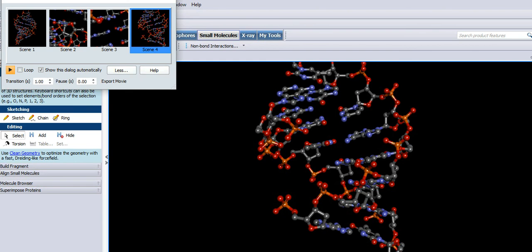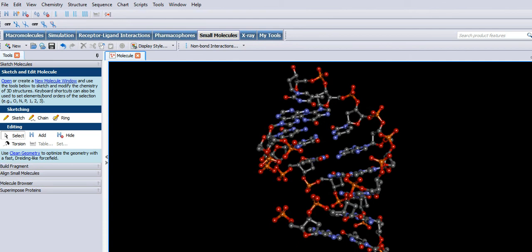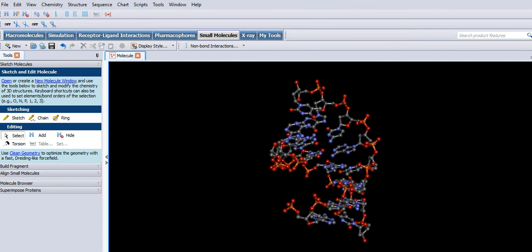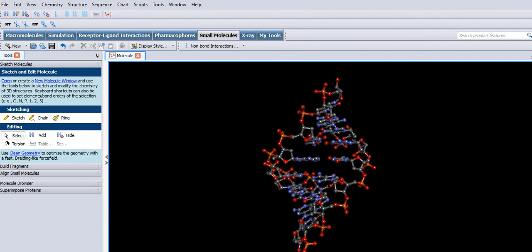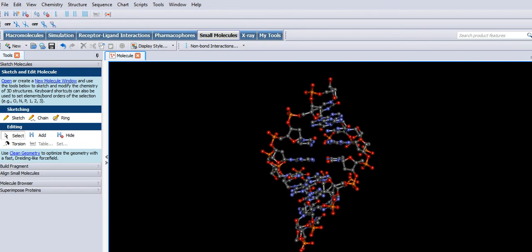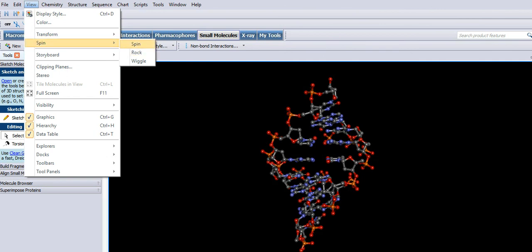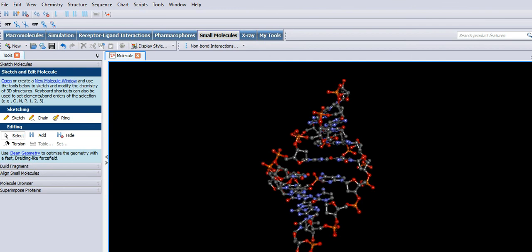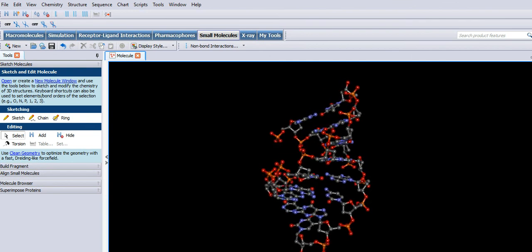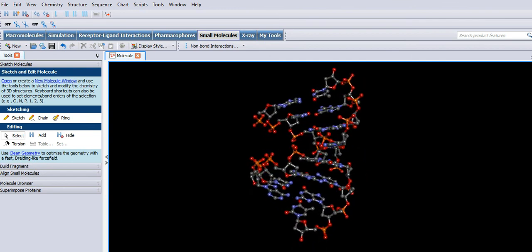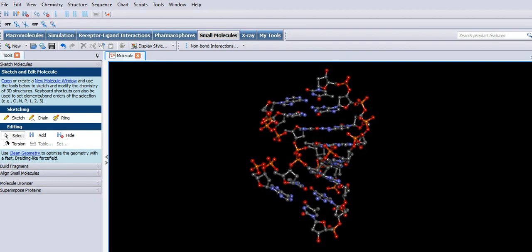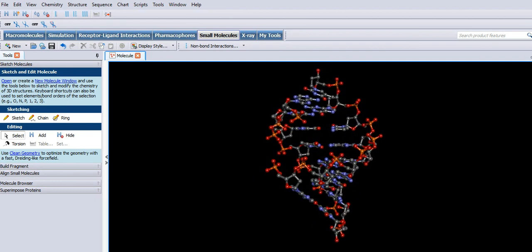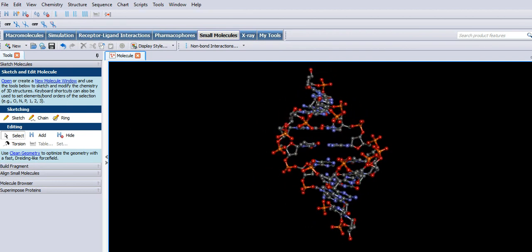Just one more thing I want to do with this. Nice configuration, there we go. No matter how often I see this iconic image, I can't fail to be impressed with it. Isn't that marvellous? Happy modelling.